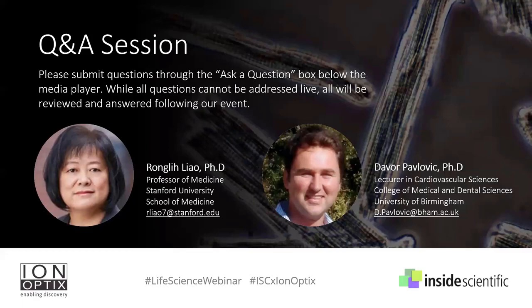Okay, fantastic. Now, next question is, how damaging is it to the heart to have a delay between excising the heart and putting it on the Langendorff system? Rongli, what's your experience with this? Okay, so this really comes down to experience. When you are hanging hearts for the first time, you will probably take more than even 10 minutes to get yourself situated and know where the aorta is, how high you're going to hang, and all those things.